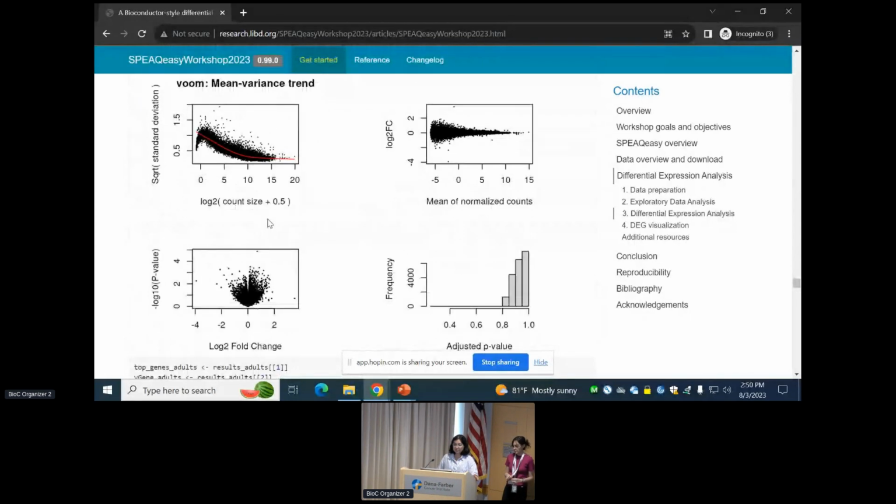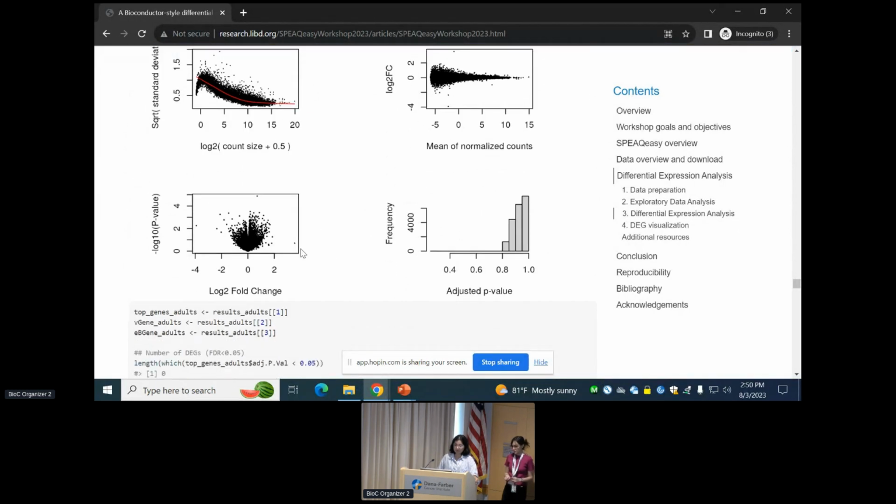And what we want to see in here is mostly these two plots. This one is like the normal volcano plot we usually see in papers. And this is the frequency of the adjusted p-value. Normally, you can plot this as adjusted p-value or also p-value. And when it's p-value, you expect to see a flat line in here. When that happens, the model is likely working.